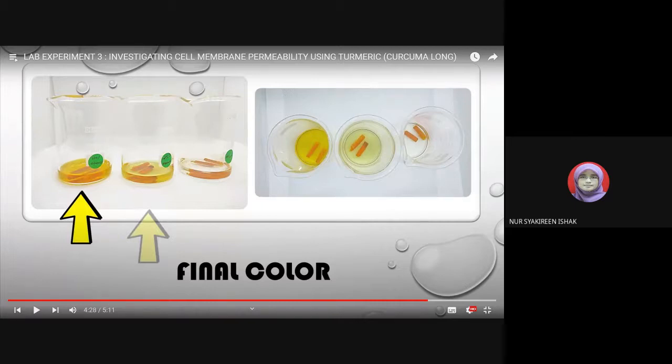Okay, because we are not using salt water or saline water or sugar water that contains sugar. We are not dealing with solution that has different concentration of salt, that will influence the movement of water. Kita nak tengok pergerakan pigment ni daripada dalam sel kepada luar sel disebabkan oleh plasma membrane to damage, disebabkan you all immerse dalam ethanol which function as organic solvent for the plasma membrane. Okay, so that one you have to include in your discussion.